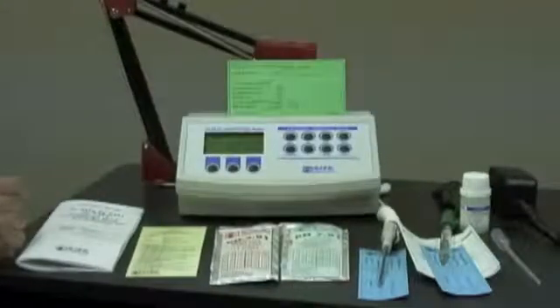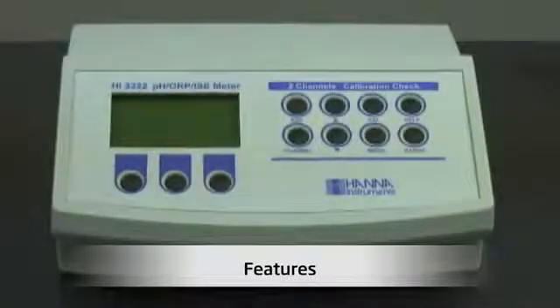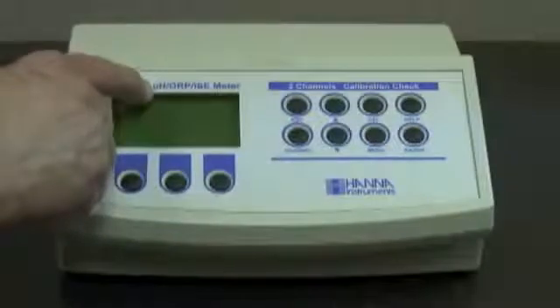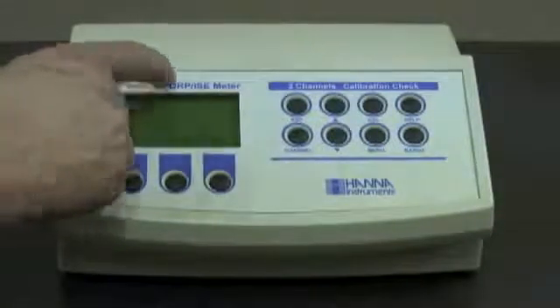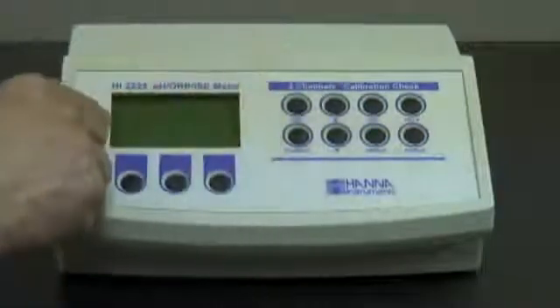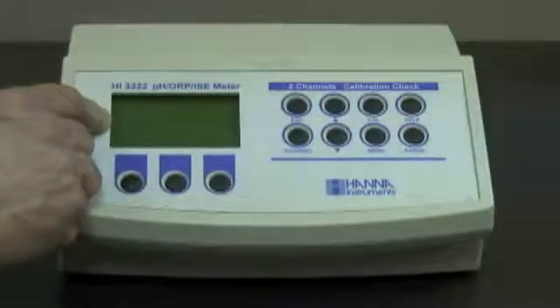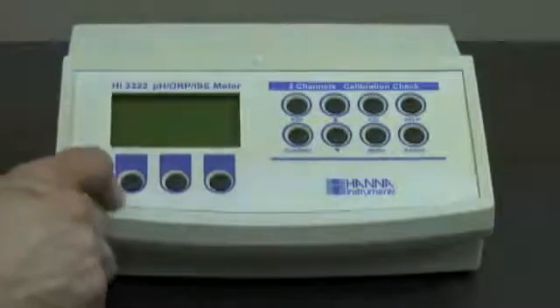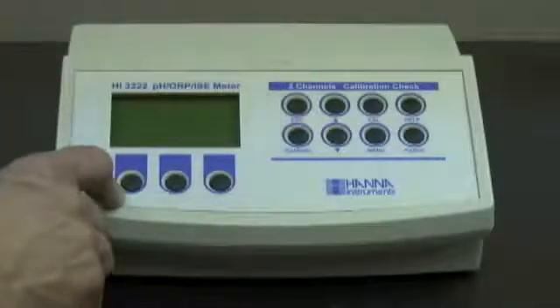Next, let's talk about the features of the meter. I have with me today for demonstration purposes our HI-3222, which is a pH/ORP/ISE meter with two channels and calibration check. Some major features of this meter are: a dot matrix LCD display for ease of use, virtual keys that will change with whatever is being shown on the dot matrix display, and an eight-button simple operation.